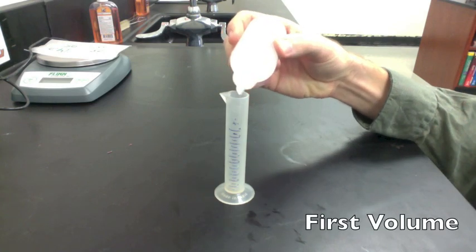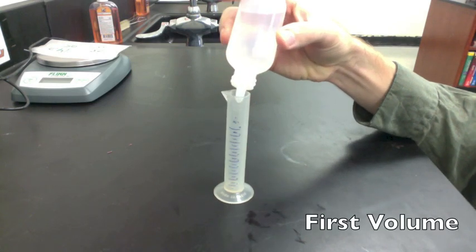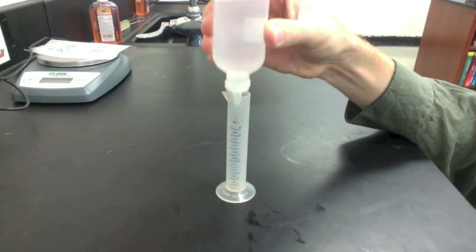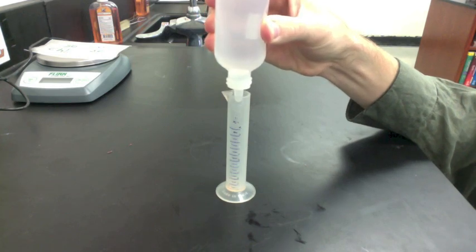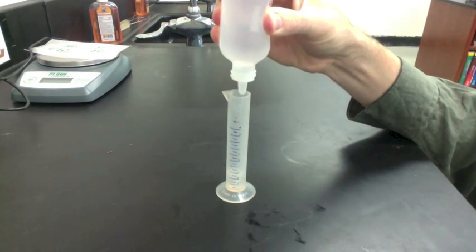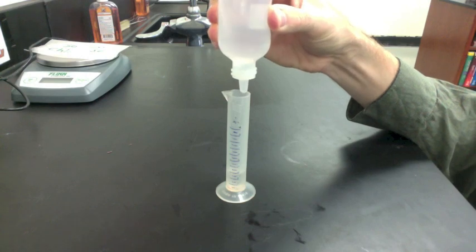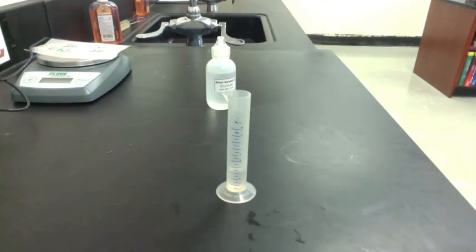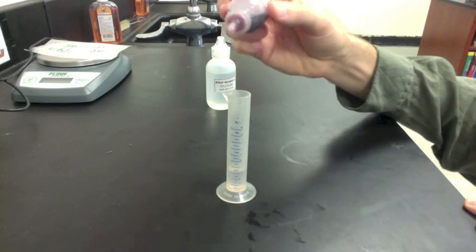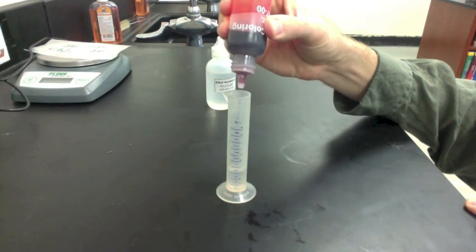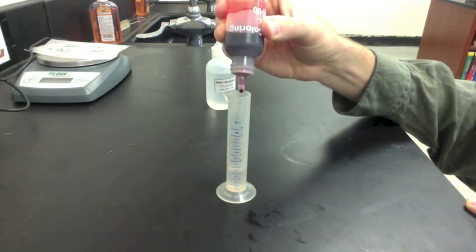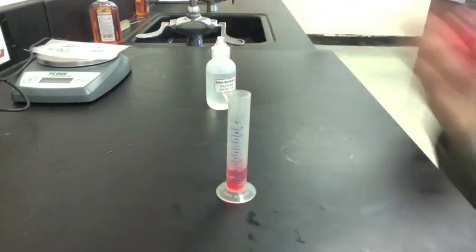To find the volume, we're going to put ethyl alcohol into an empty graduated cylinder. Ethyl alcohol is colorless. It's hard to see on camera. So I'm going to put one drop of red food coloring to make it easier to see.